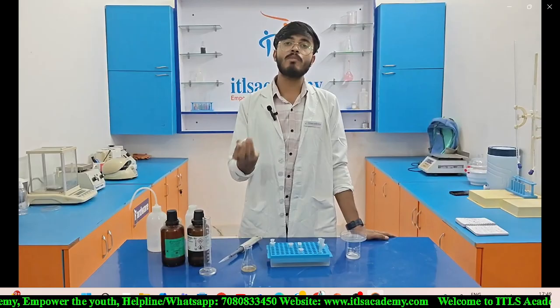Now after adding isopropanol in each of the tubes, we need to invert it at least for 5 minutes, and after that we need to perform centrifugation at 10,000 rpm for 10 minutes. So after performing the centrifugation, again we need to discard the supernatant and the pellet should not be harmed. And after discarding the supernatant, we need to add 600 microliter of 70% chilled ethanol in each of the Eppendorf tubes.